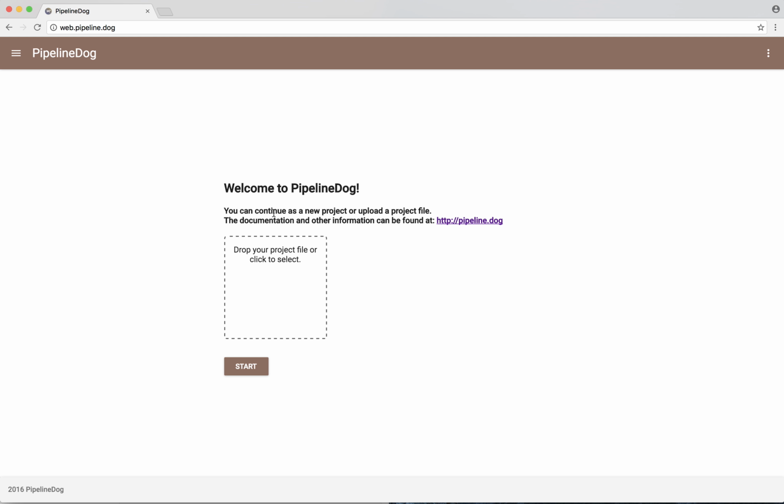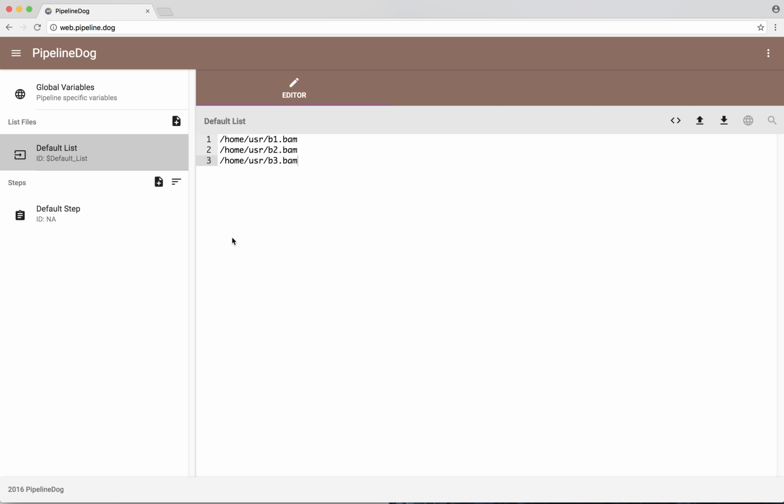Since this is the first time we use PipelineDog, there's nothing for you to select and upload. You can simply click on Start, and please read the documentation for PipelineDog so that you get a rough idea of the design philosophy of PipelineDog and the terms we'll be using in this video tutorial. But put simply, PipelineDog is a tool for people to create analysis pipelines and then run those pipelines.